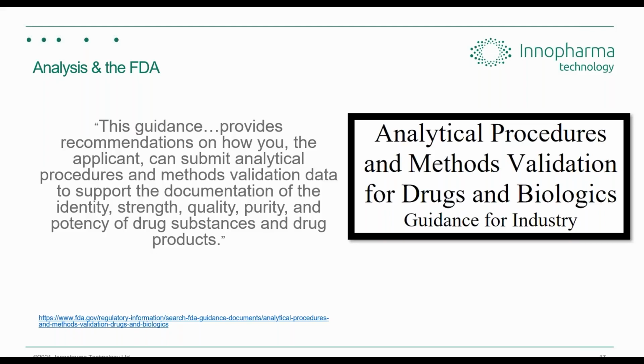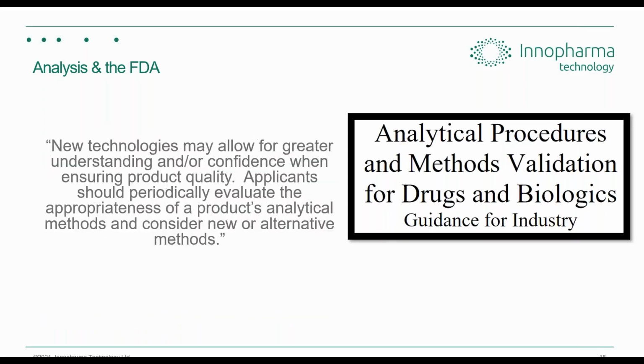So why would you do something like this? Why would you do this analysis? Well, maybe over the life cycle of a product, new information and assessments might become available. You know, like Sieve's been around for centuries. New digital methods are coming into vogue. They're, you know, inline to real time, for example. So you might get better understanding of your CQAs and what's happening in your process by bringing them in. But this may warrant then the development and the validation of a new alternative analytical method. And that's what this document really highlights.